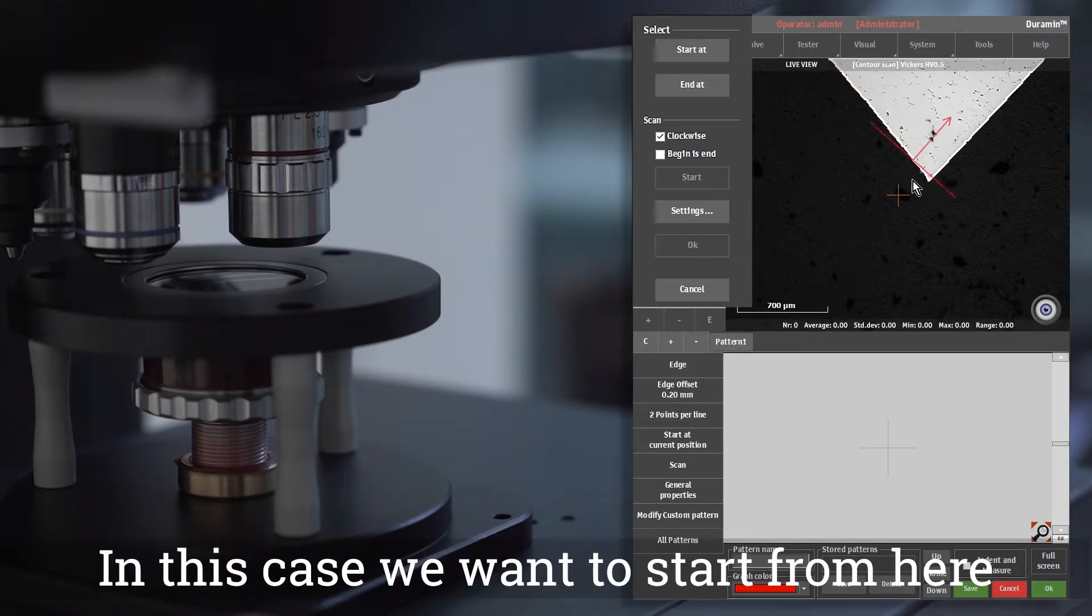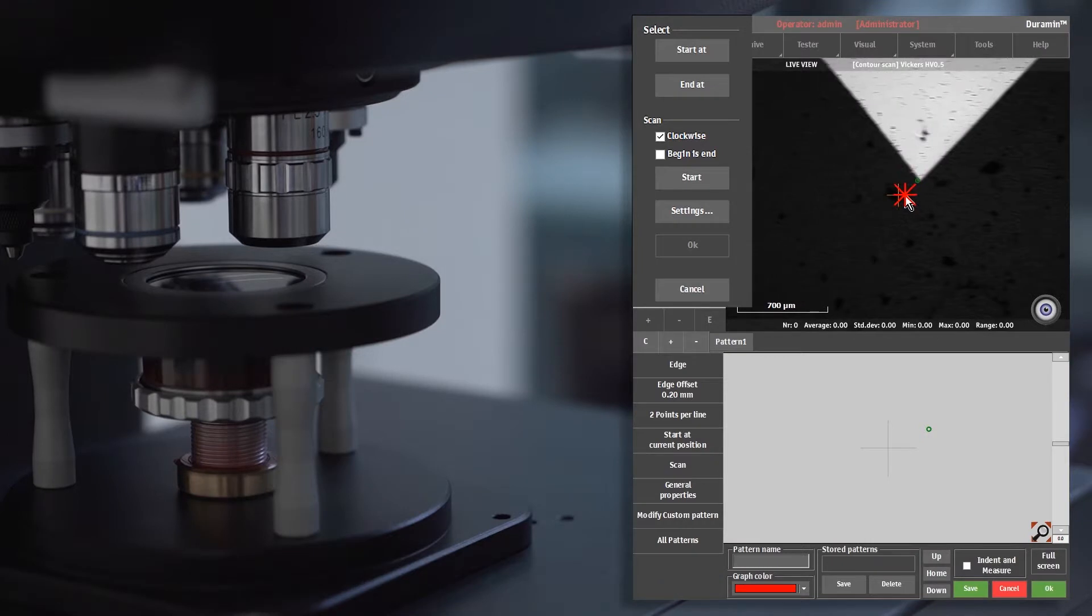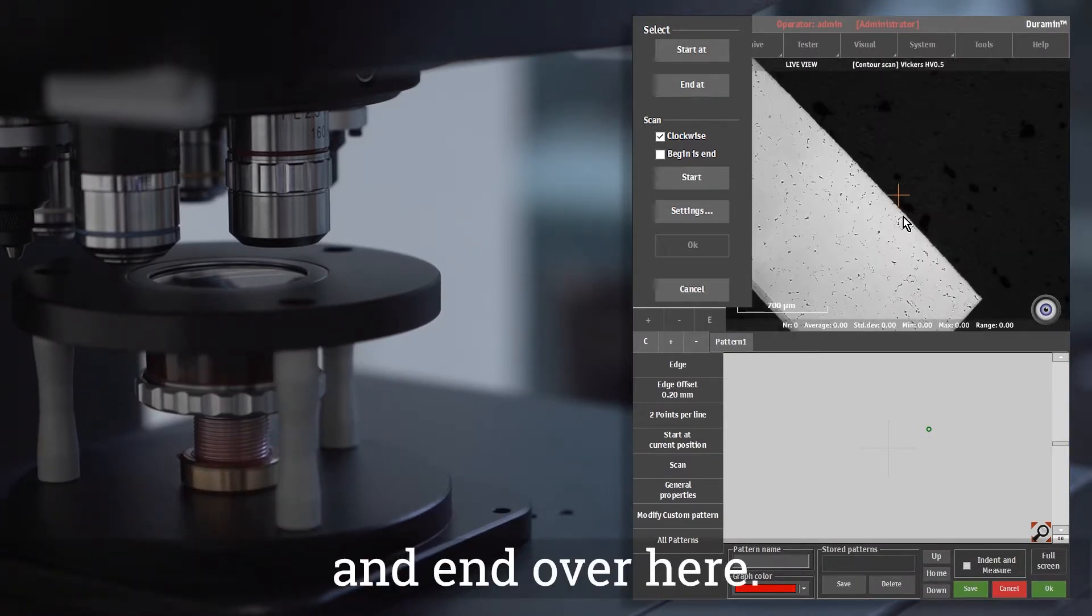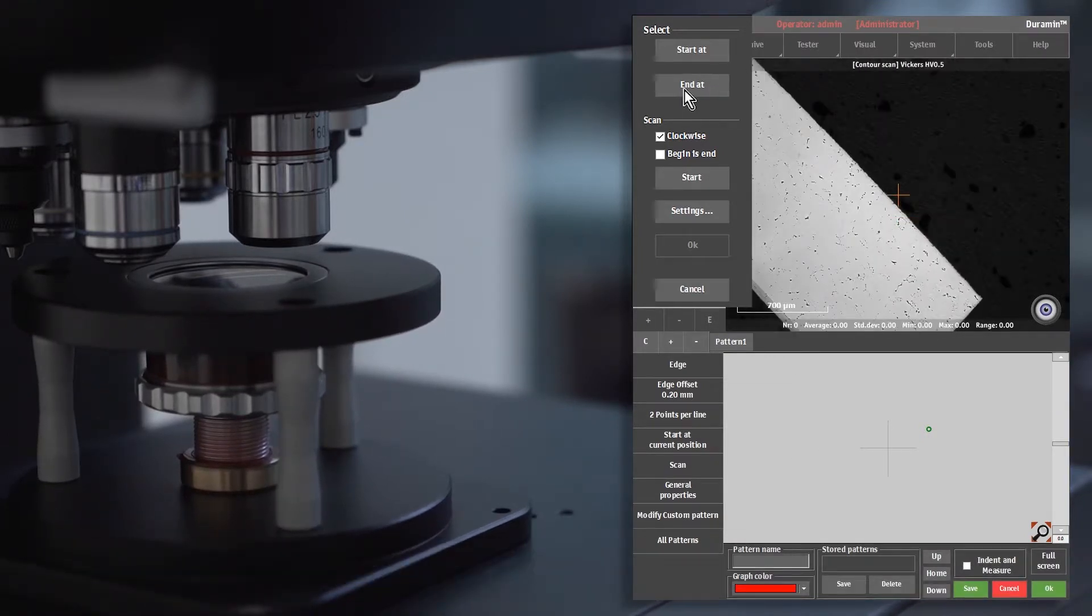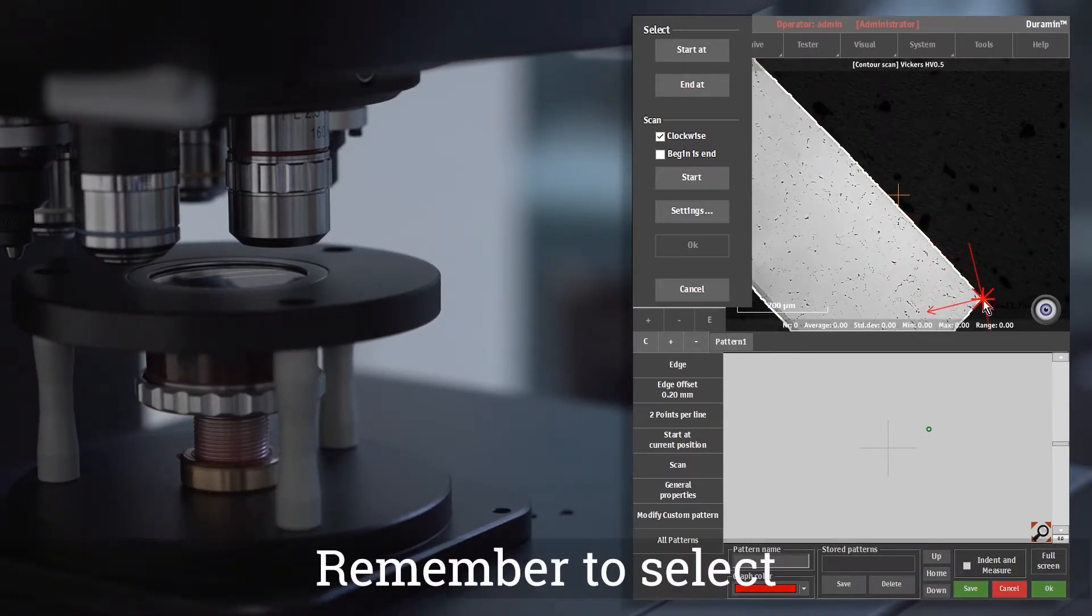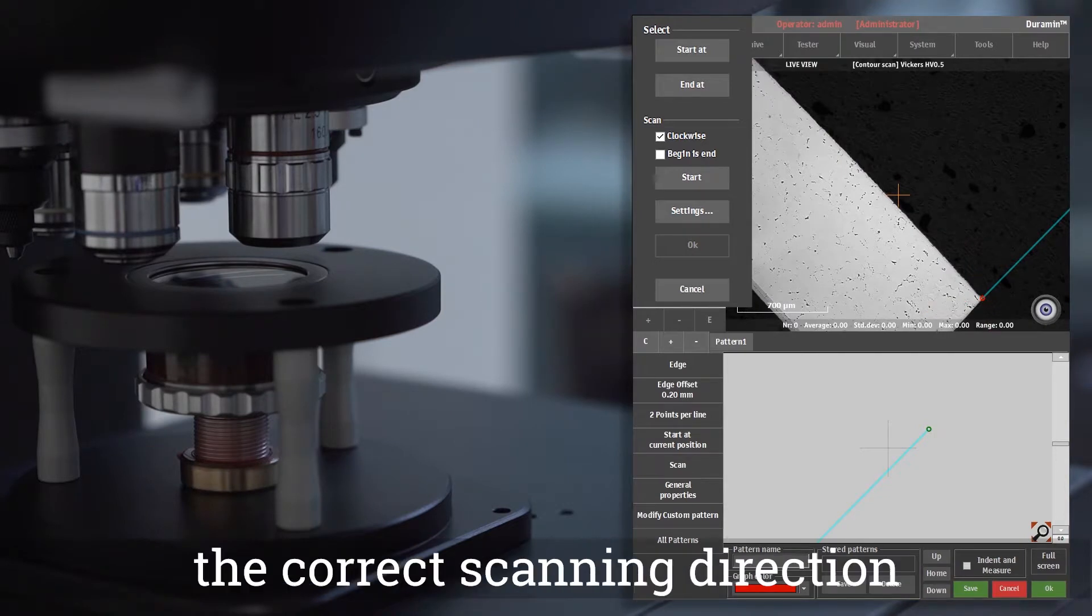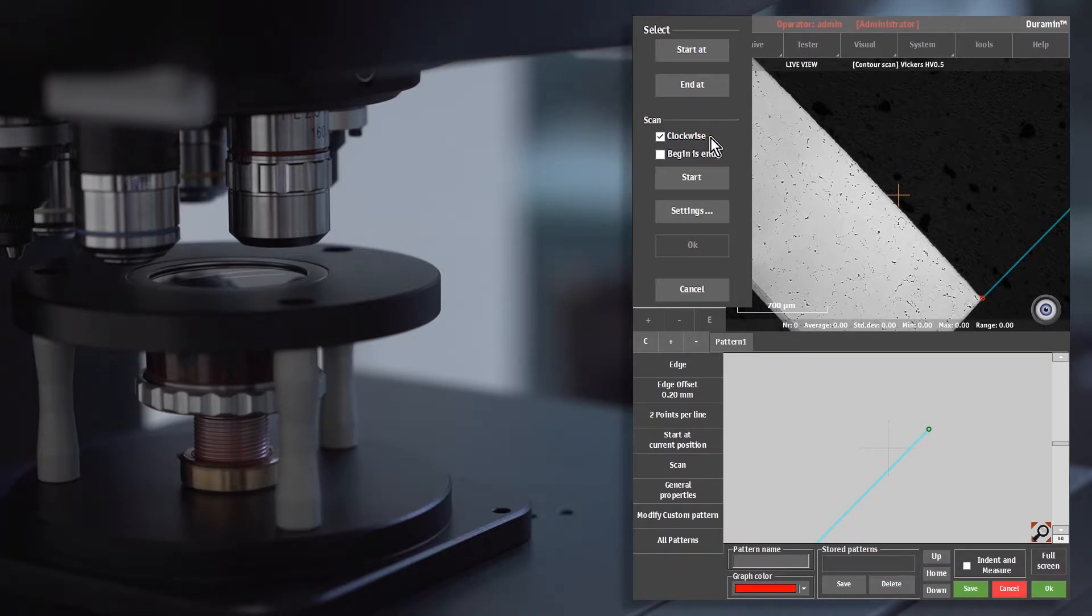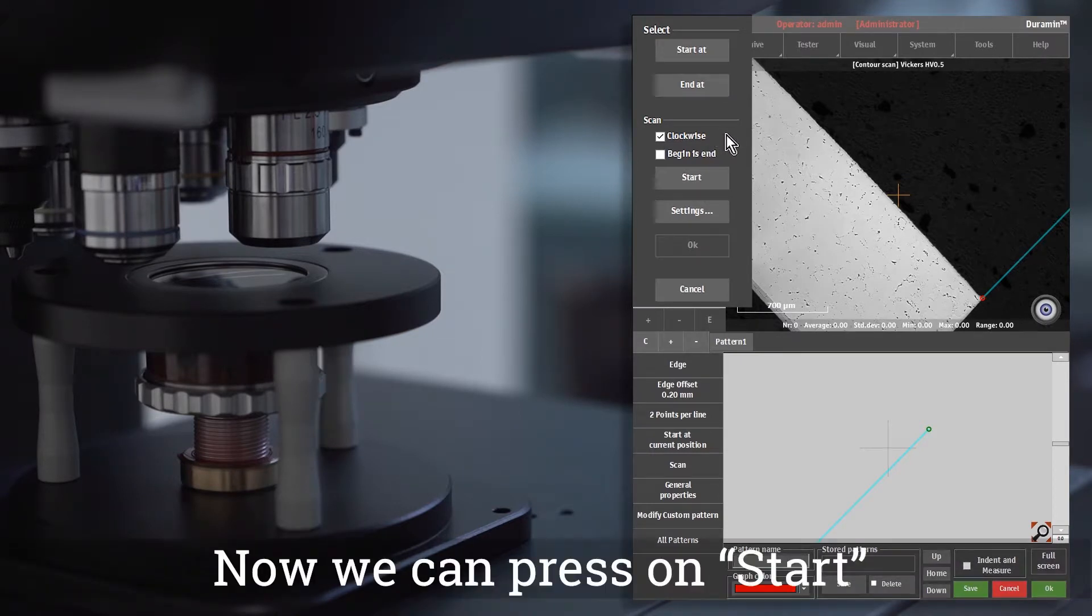In this case we want to start from here and end over here. Remember to select the correct scanning direction, in this case clockwise. Now we can press on start.